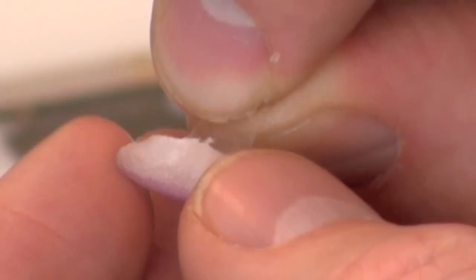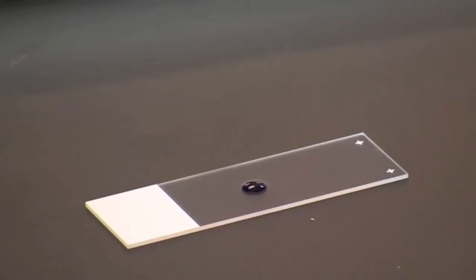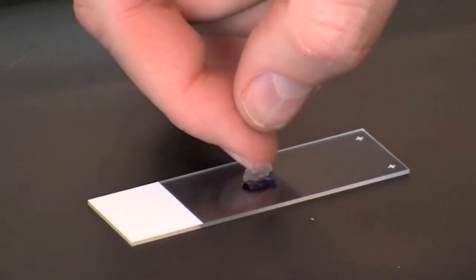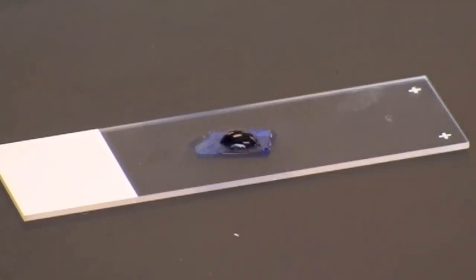Peel a piece off the inside epidermis of the onion leaf scale that is roughly 1/2 to 1 centimeter squared. Place the piece onto the drop of stain on the slide. Add another drop of Fast Blast DNA stain on top of the piece of onion.